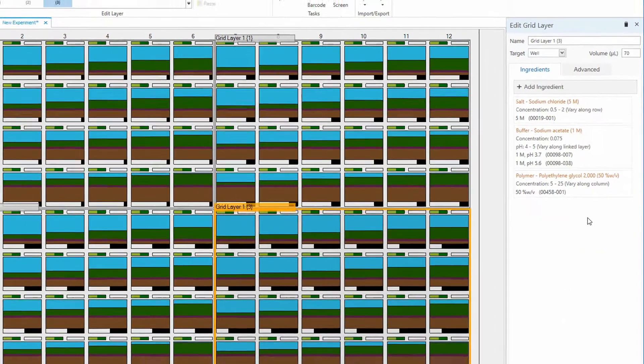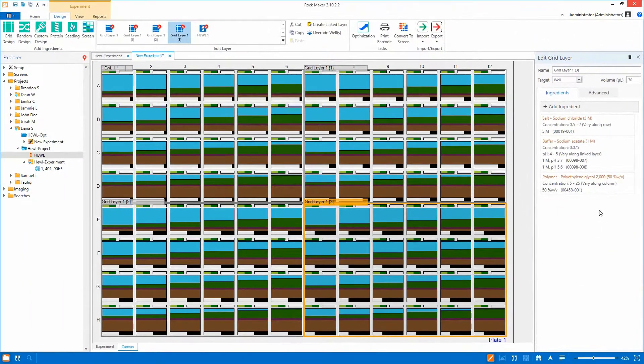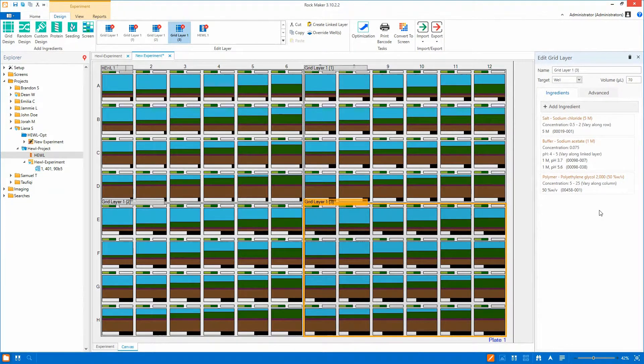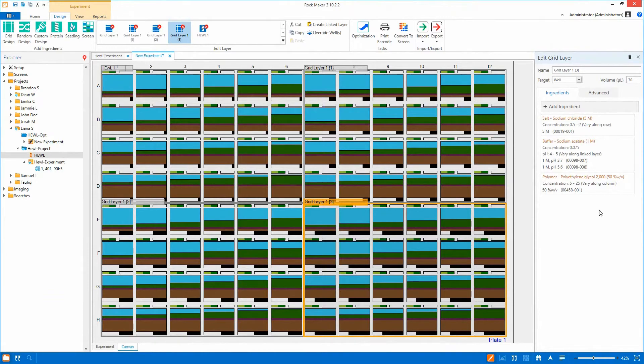With multiple options and intuitive steps, you can use Rockmaker to quickly create and screen a wide range of optimized conditions.